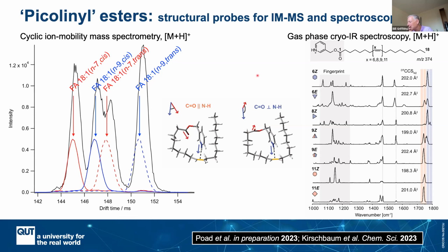Okay, so maybe I'll ask a last question if there aren't any more. You showed us a huge number of different double bond positions. Do you think we can now convince Avanti and Cayman to actually synthesize standards so we can be 100% sure that your probable identifications are definite identifications? Do you think that's a realistic goal?